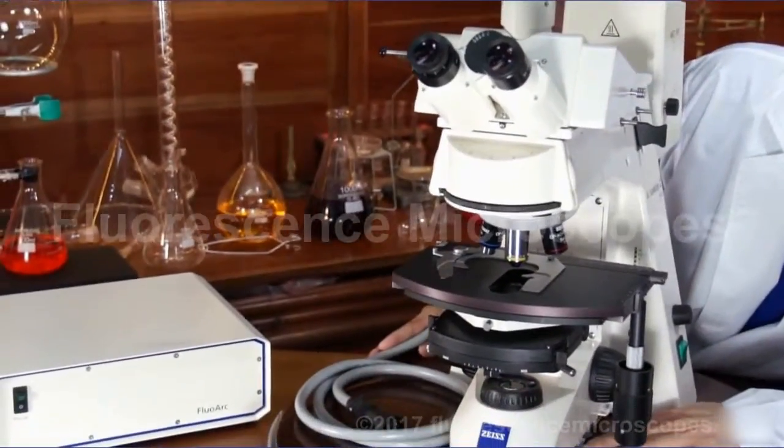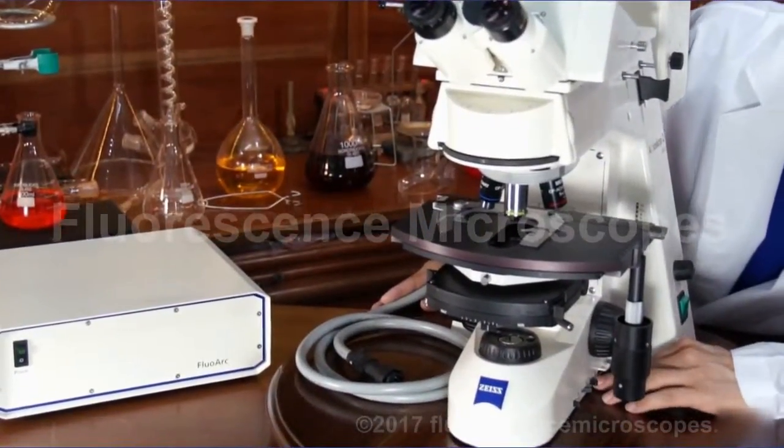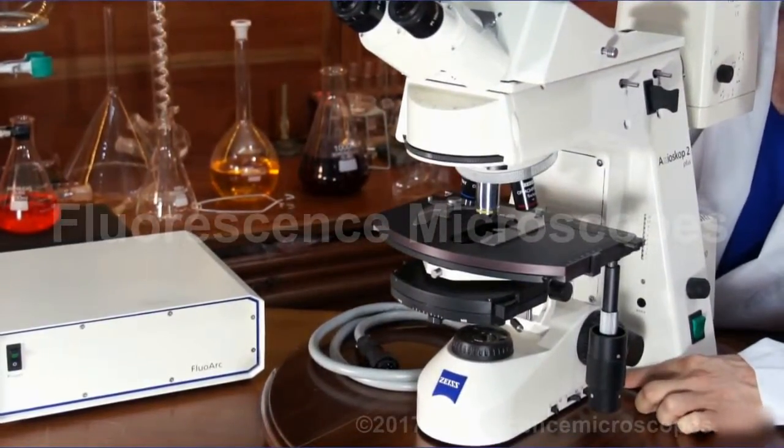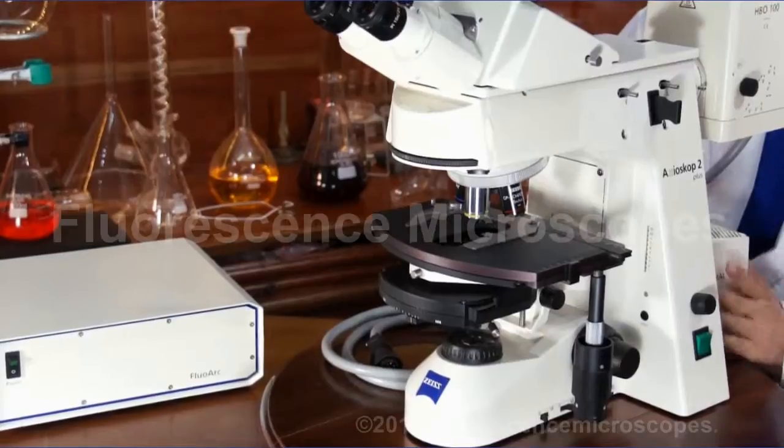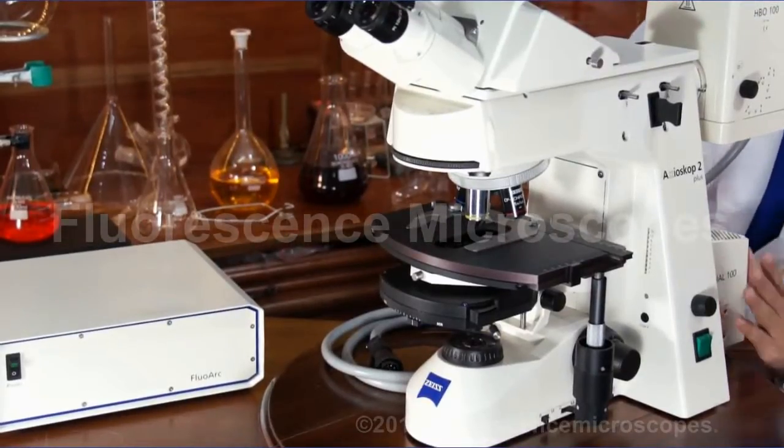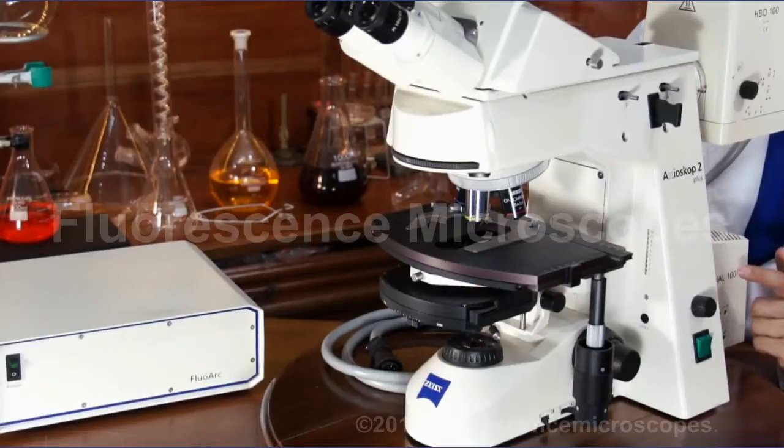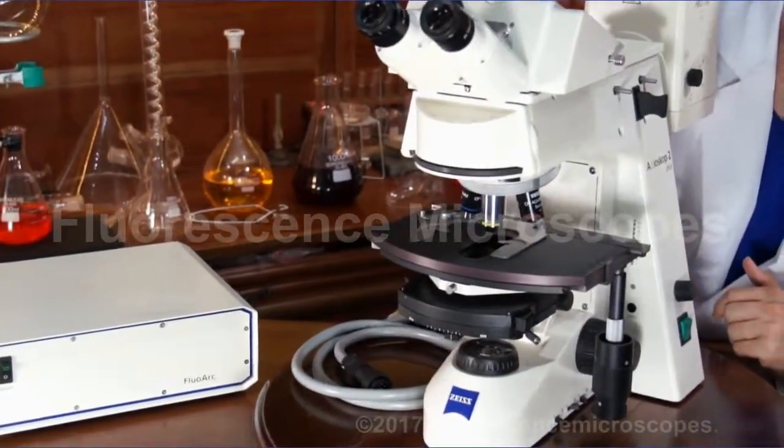These neutral density filters: 1.5, 6, and 25. It's also got a frosted diffuser. I leave this frosted diffuser in place so that you don't get any distortion from looking at your filament in your halogen bulb. You want that totally diffused, so you can't see it in the image at all.